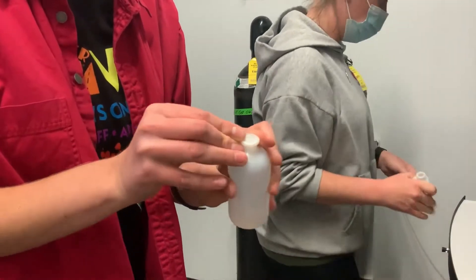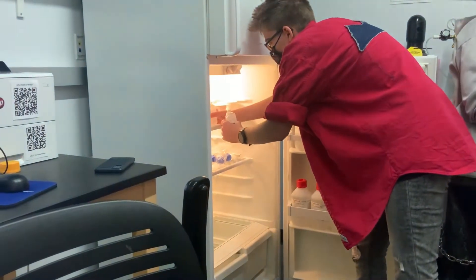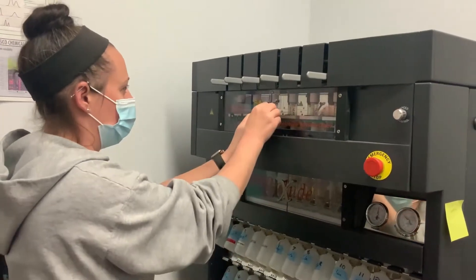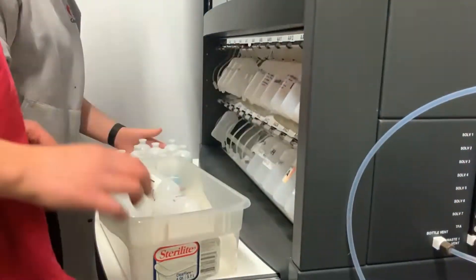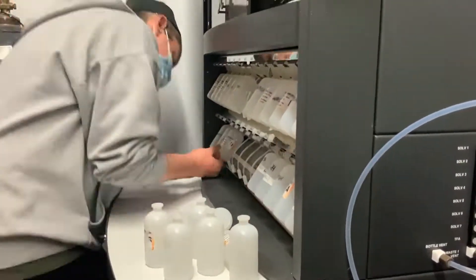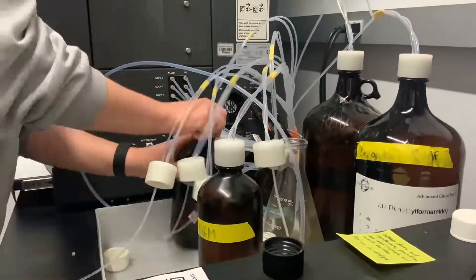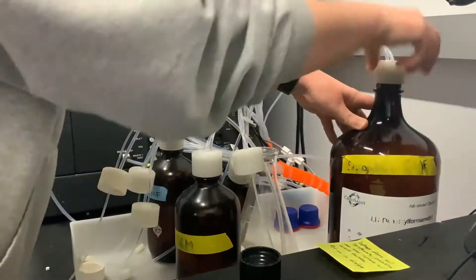To prepare to clean the synthesizer, parafilm and store any leftover amino acids and make sure all wash vessels are in place. Remove all of the amino acid bottles and replace them with wash bottles. Replace all of the reagent and solvent bottles with wash bottles except for the DCM bottle.